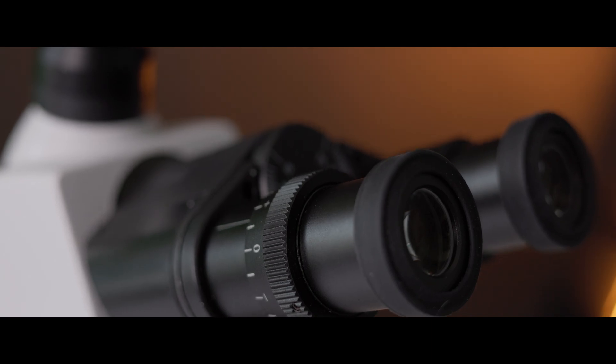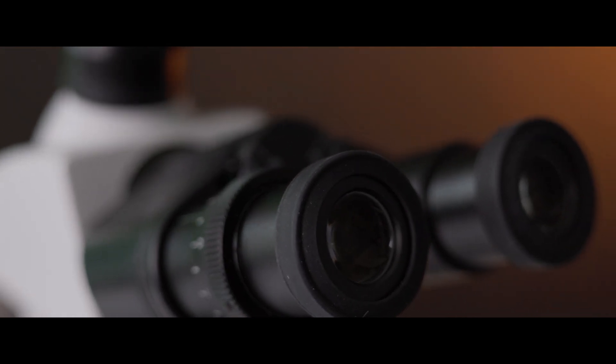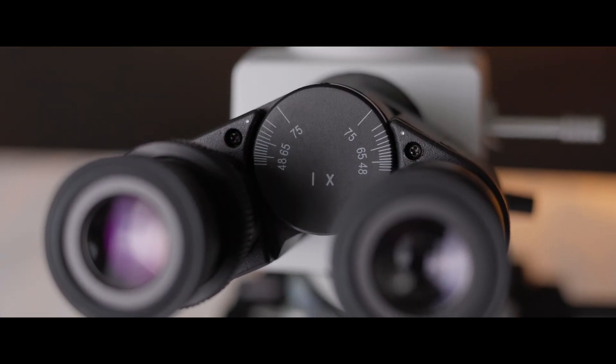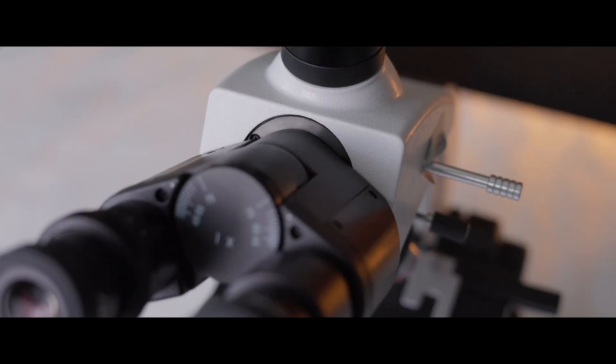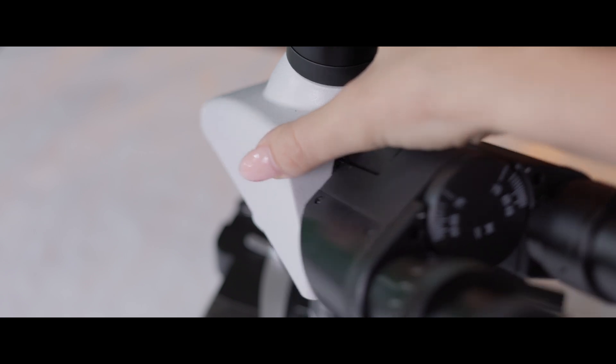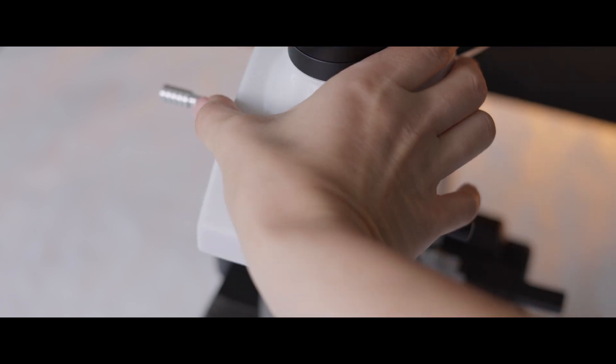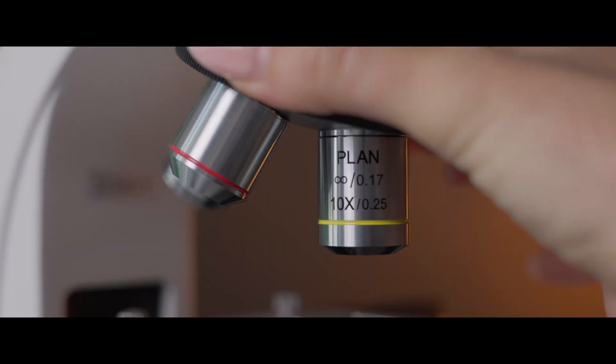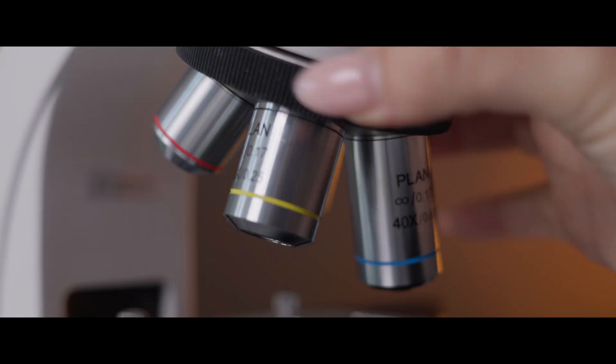If you're like me and you're going to spend hours at the microscope, comfort is key. The OM139 has a 45-degree inclined head that's also rotatable 360 degrees, so you can adjust it to any angle that works for you. I love how flexible it is, especially when I'm switching positions to get a better view. And with the reversed nose piece, changing slides is a breeze without feeling cramped.